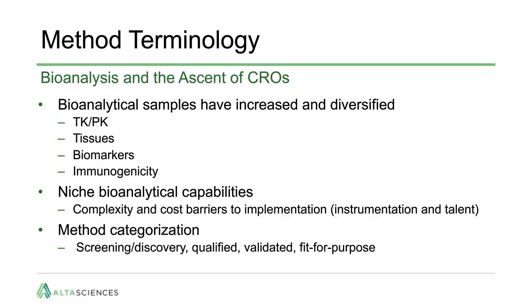I wanted to take the opportunity to discuss method terminology. In addition to traditional TK-PK sample analysis, bioanalysis now often includes tissues, biomarkers, immunogenicity, among other possibilities. Bioanalytical support at all stages may now be shared by the innovator company and multiple CROs. Niche bioanalytical capabilities requiring specific instrumentation and scientific talent are supported by specific laboratories.